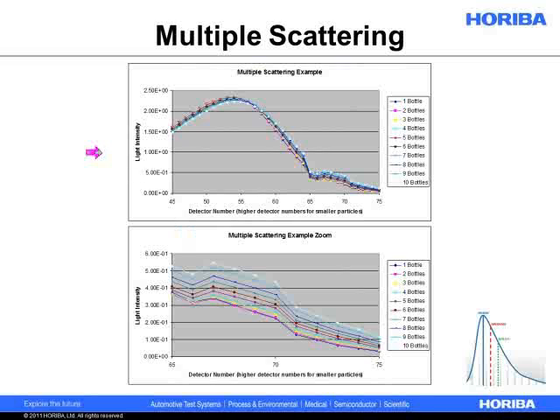And if we could extract the light scattering patterns for all 10 bottles, we'd see another trend taking place, which is that more and more light is being scattered to the wide-angle detectors. In the LA950, wide-angle detectors are the larger numbers. So as we go from detector 45 to 75, the angle of scatter is increasing from, I don't know the exact angle, but let's say in general from 0 to 180 degrees.